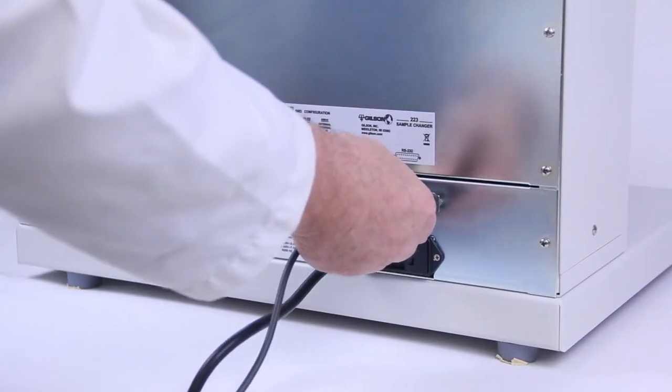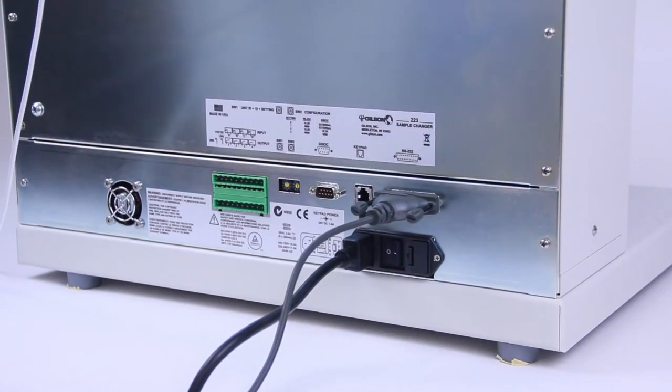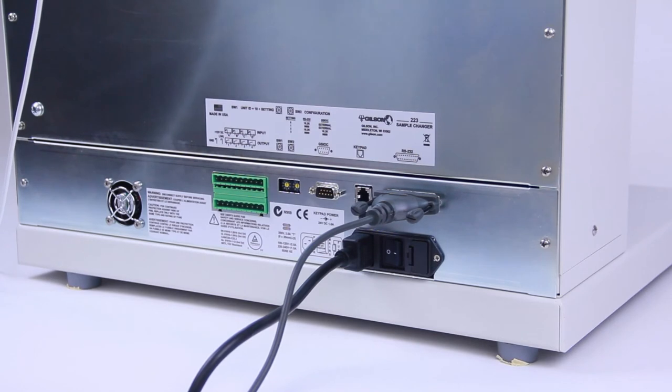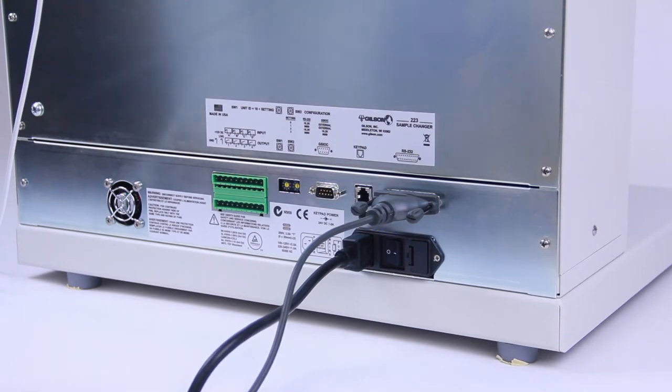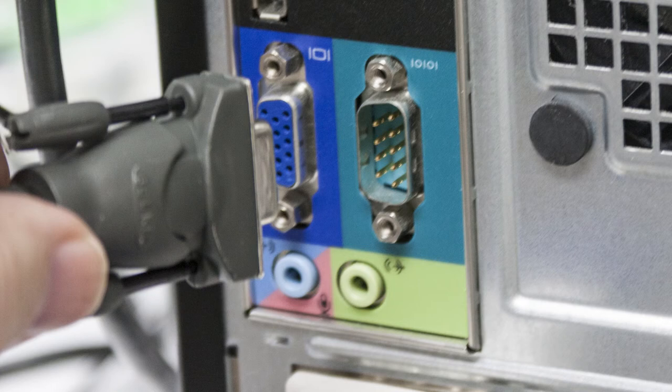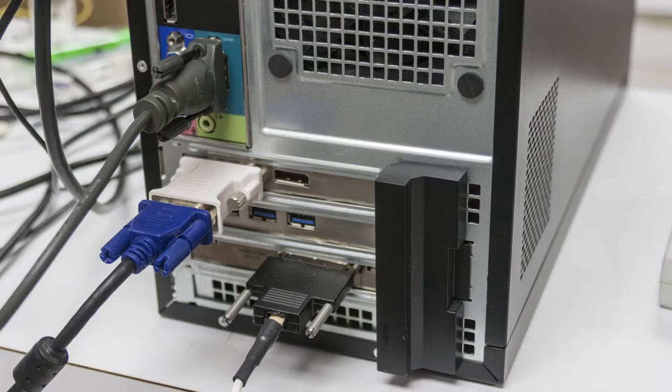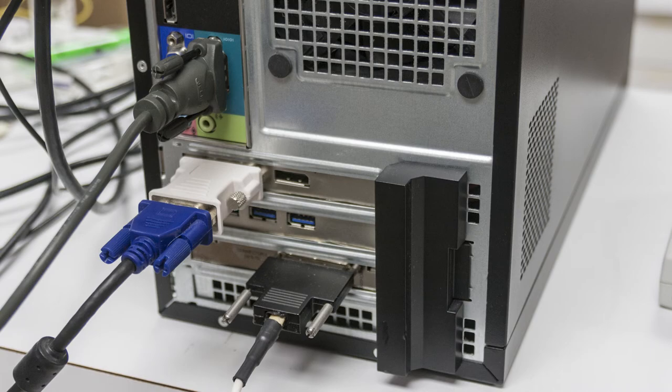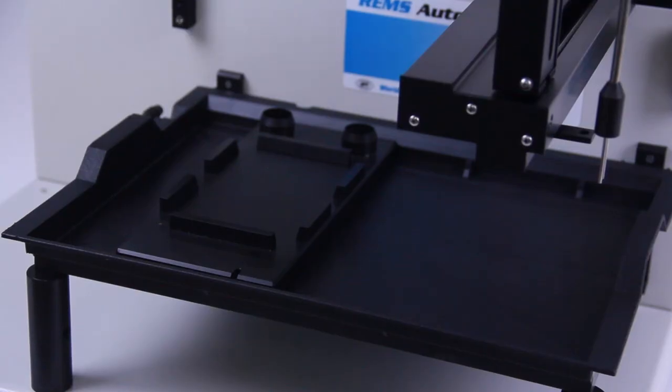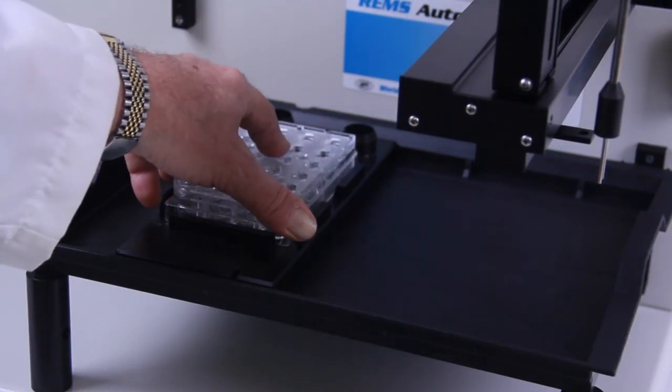To control the action of the robotic arm, the included RS-232 cable connects the REMS robot to the RS-232 port on the computer. Now it's time to check your user manual and begin programming the REMS robot to run the tests you need.